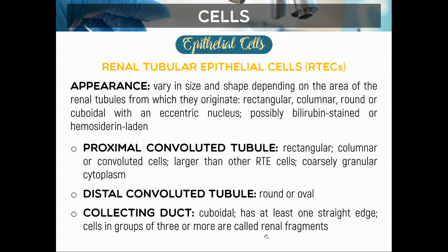Good day everyone. Today we continue our discussion on the microscopic examination of urine. This is the last type of cell we will encounter, and for the remaining slides we will proceed with casts and urinary crystals. Here we have our renal tubular epithelial cells, or RTEs. Their appearance varies in size and shape depending on which tubule they originate from. We have three types of tubules: the proximal convoluted tubule, the distal convoluted tubule, and the collecting duct. They may appear rectangular, columnar, round, and their nucleus is eccentric, meaning not at the center, unlike transitional epithelial cells whose nucleus is centrally located.